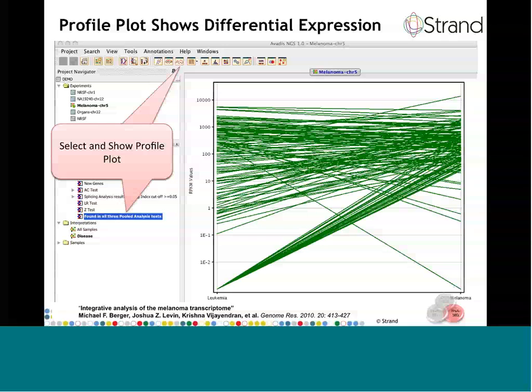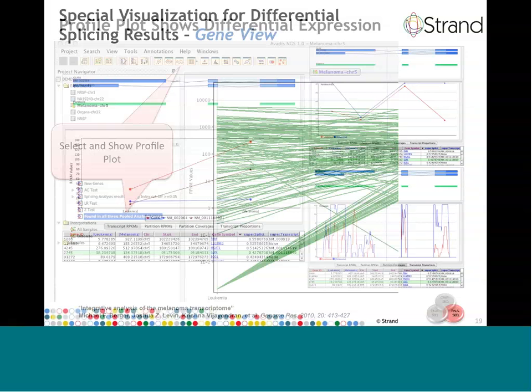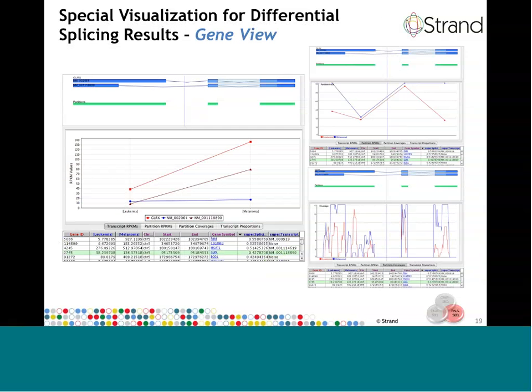So we have the usual set of differential expression algorithms that have been made popular by the array-based expression analysis tools such as GeneSpring. But in addition, we have some algorithms that are optimized for RNA-Seq data as well. But profile plots only really show half the story. We all know that it's not the gene that is expressed, but its constituent transcripts. While showing the profile plot for each of the transcripts is feasible, it soon becomes difficult to visualize this amount of data. If we assume, as many have, that each gene can result in an average of 10 transcripts, we can expect to see over 250,000 transcripts if all genes were active at one point.